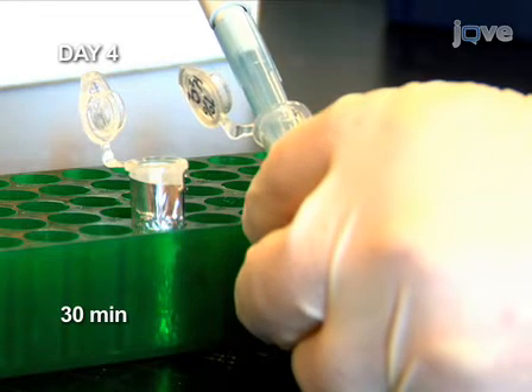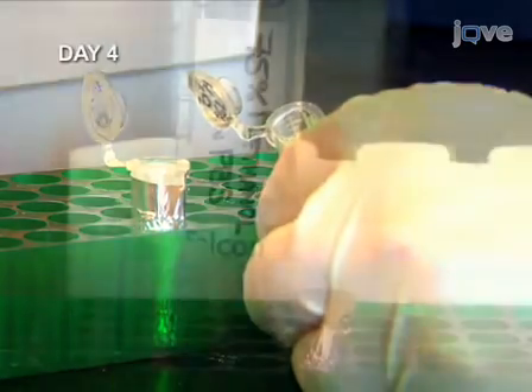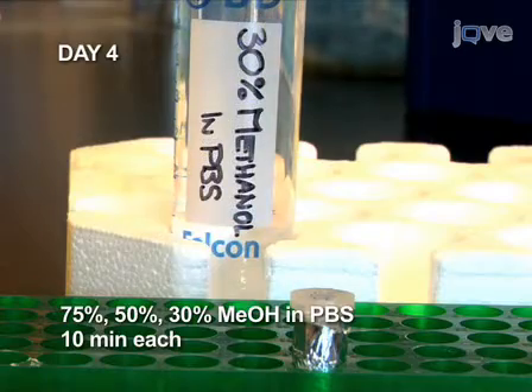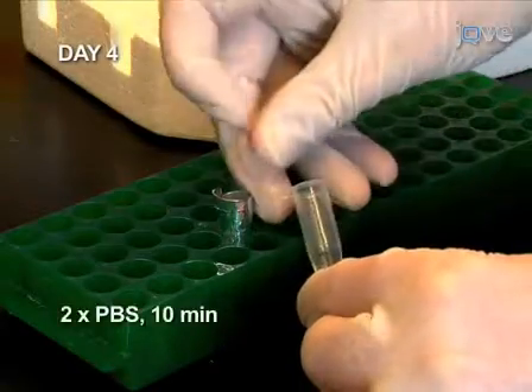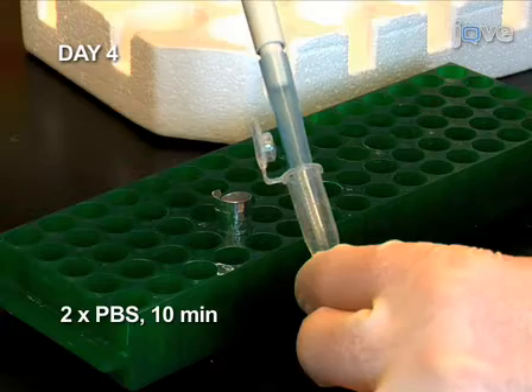Otherwise, residual peroxidase may interfere with the detection of the digoxygenin probe. Transfer the embryos through a series of washes of decreasing methanol concentration, ending with two 10-minute PBS buffer washes. This ensures that all of the methanol is removed.